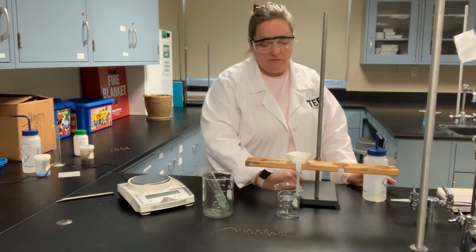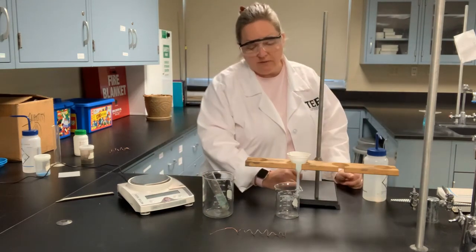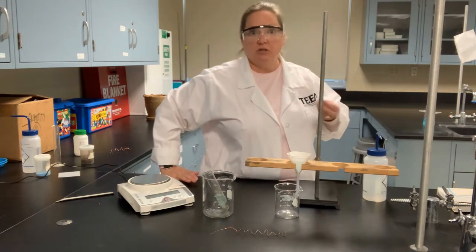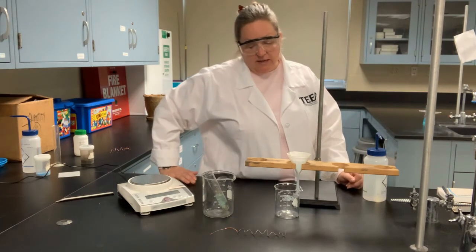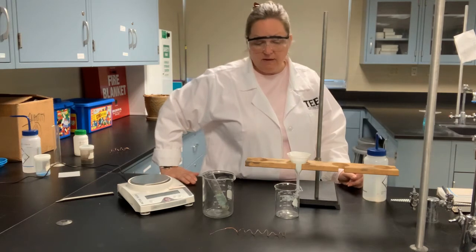because it creates a little bit of capillary action there, as we get a stream of the liquid running down the side of the beaker, and it's like inertia. Once it gets the process going, momentum is the word I'm looking for, not inertia, I apologize. Momentum, it gets it going and it keeps it going, and it has to do with creating that steady stream running down the side of the beaker.